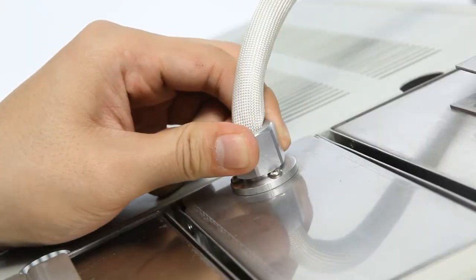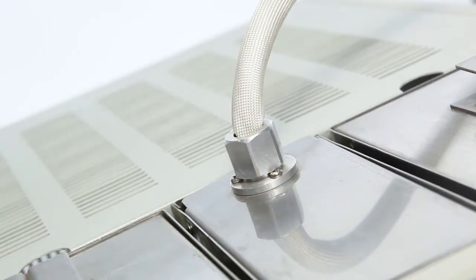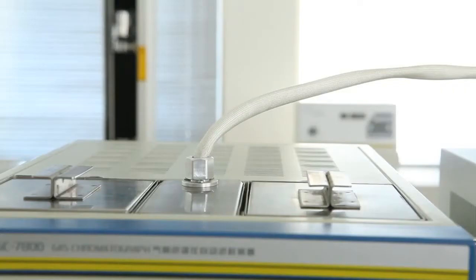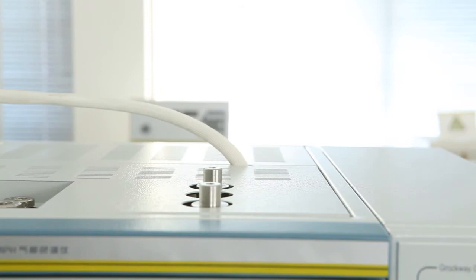The sample transfer line has been chemico-physically treated and is temperature controlled to prevent sample condensation and absorption. The sophisticated design increases the detection limit and significantly improves the accuracy of test results.